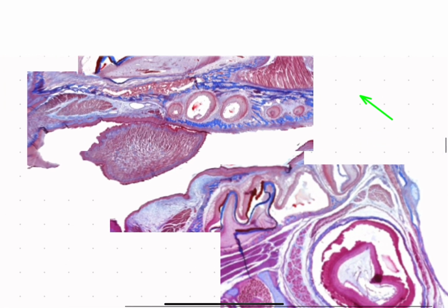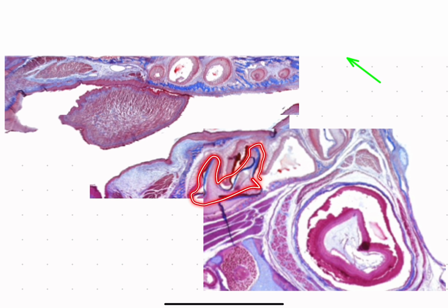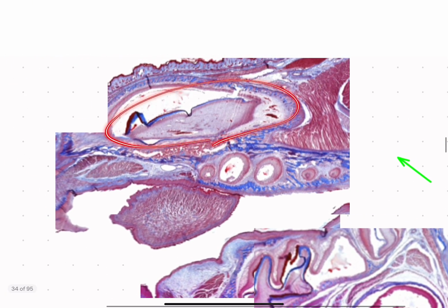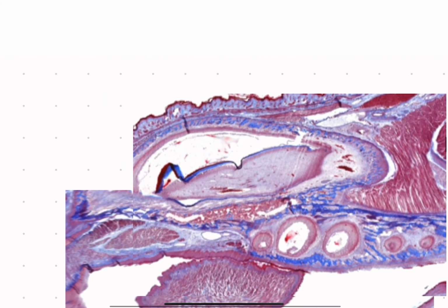Here we have the head development of the embryo. We saw this before. We can see the characteristic eye shape with the neural retina within. We can see those teeth, and we are going to zoom into the teeth, but not those specific teeth, this specific teeth. Here we can still see some more tooth development. We can see the intramembranous ossification in this bright, beautiful blue, and we can see the tongue development as well with all of these striations making up all of the muscle fibers.